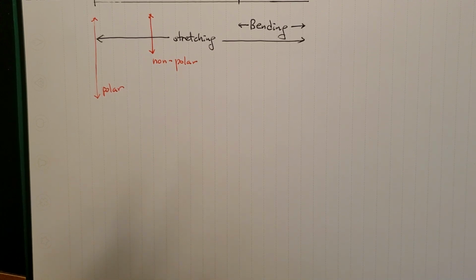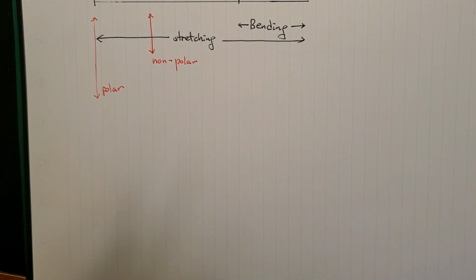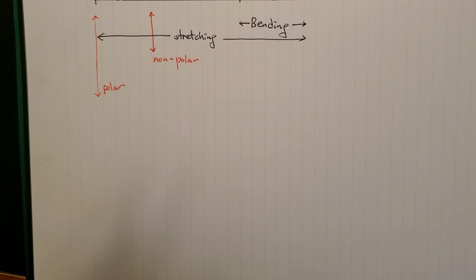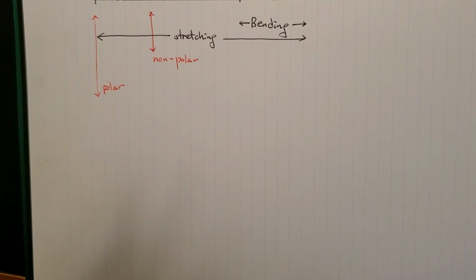So today here we're going to look into some of those peaks, because the OHs and NHs give an intense peak in this region, right? 3000 to 4000, and the carboxylic acid OH even comes across the 3000, entering the 2000 region. And then CO double bonds and CO single bonds and other heteroatoms also show intense signal in the bending vibration area, so no problem to read them.